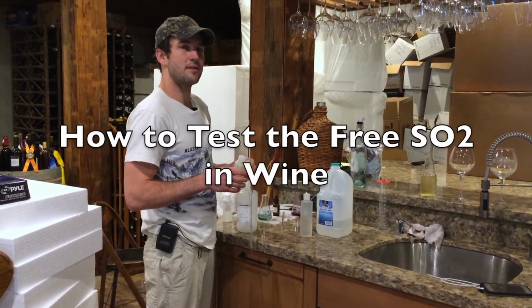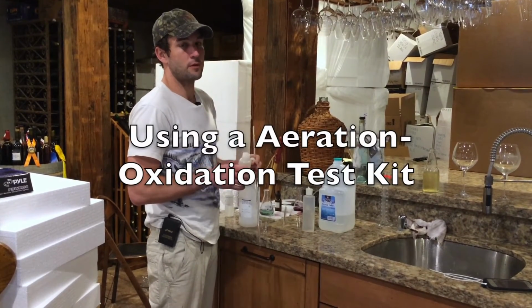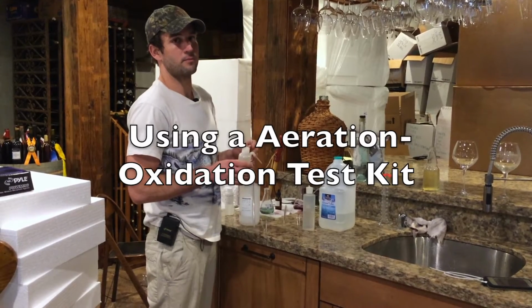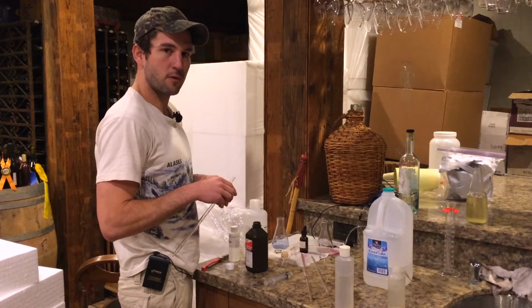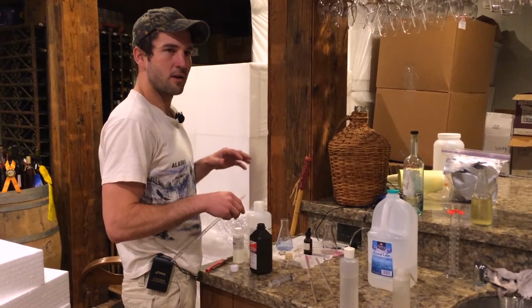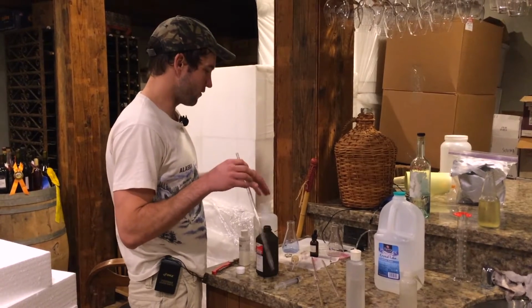Today we're going to be testing the free sulfur dioxide content of our wines, which is the most important and most frequent test you're going to use in home winemaking. It's a little complicated looking, but it's actually pretty straightforward. Now I'm going to give you a pretty simple explanation of it here, not really try to explain why the test works, but just know that the test works and follow the instructions and you should be able to do it.